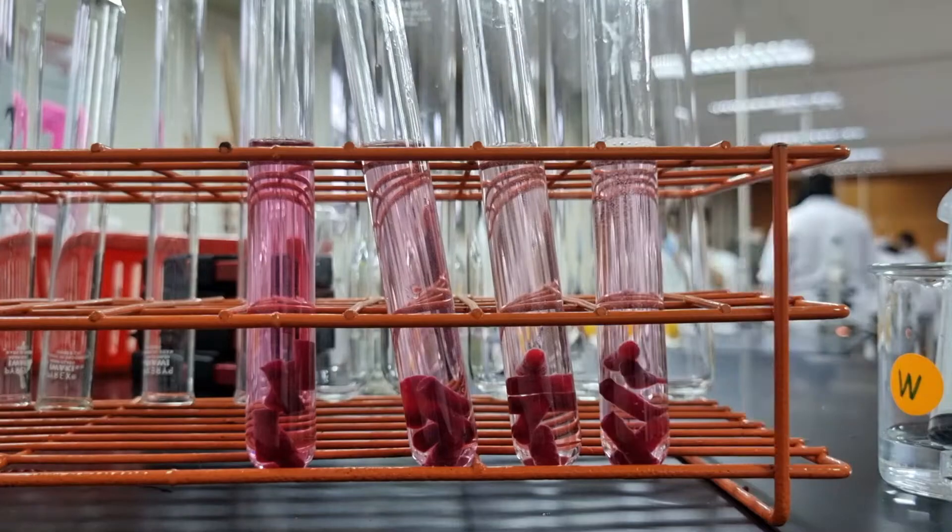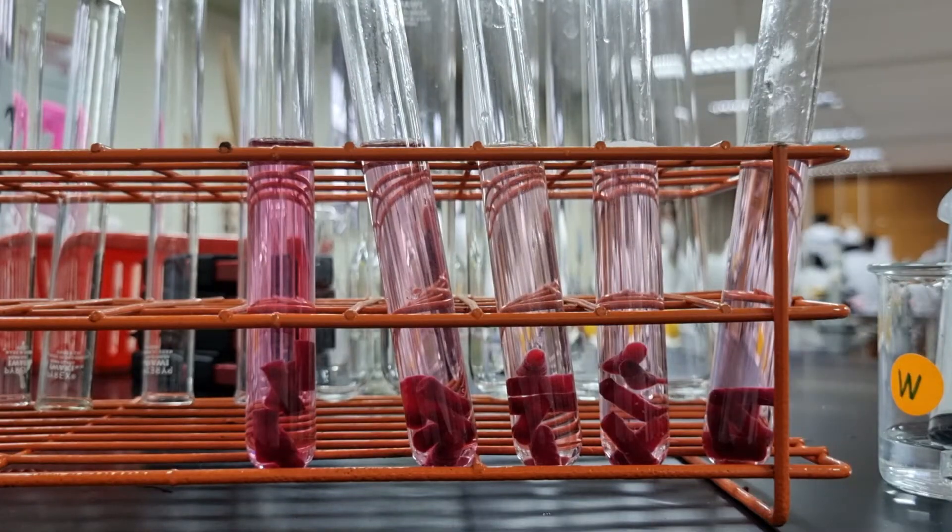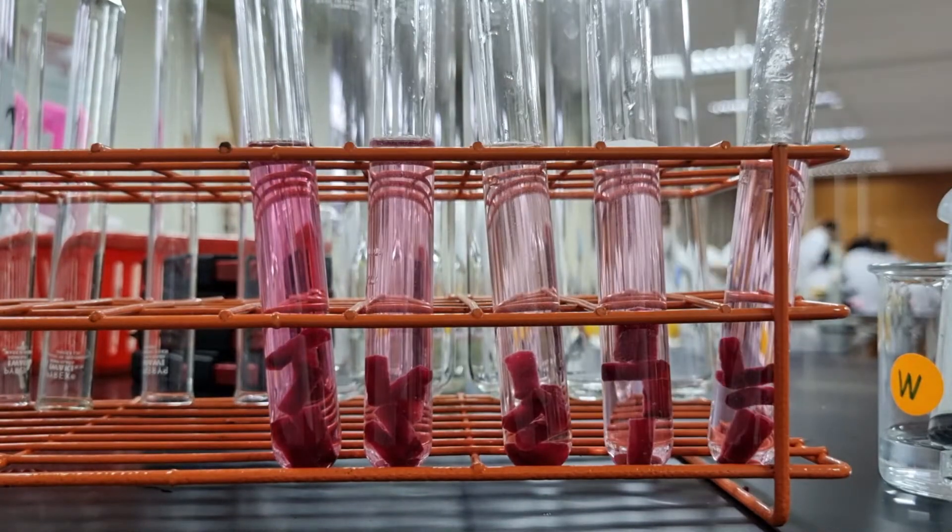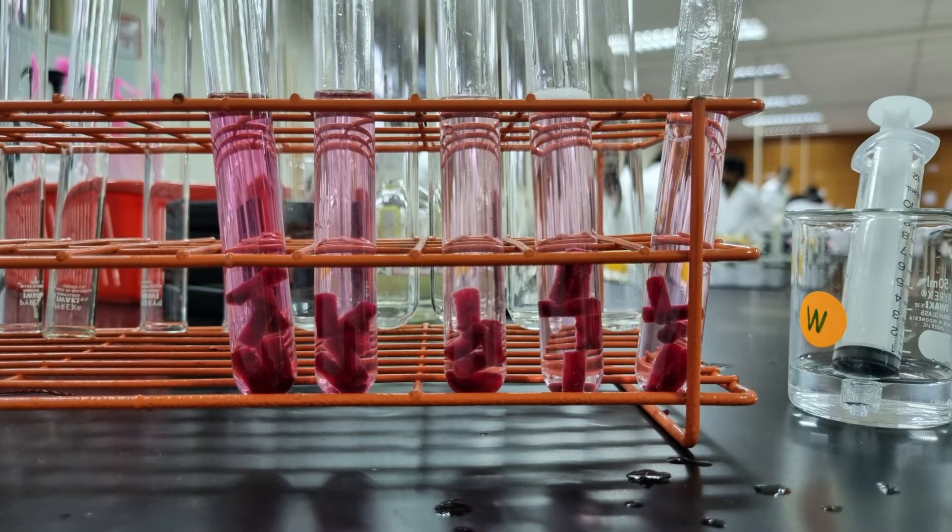However, this is also a source of error because it's impossible to get the dye evenly distributed 100% of the time. We can only do this every minute. So that is a problem.